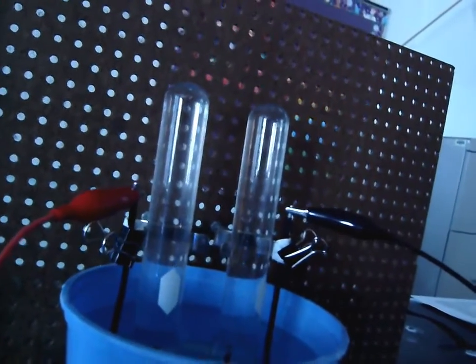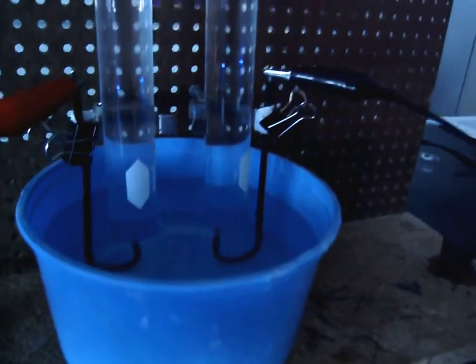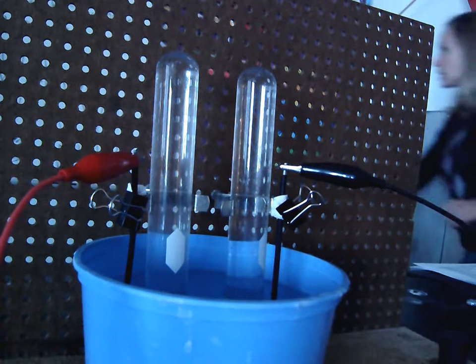Then we have these two things called electrodes. They're like little black J hooks, right? Let me show you what they look like when they're not attached to the setup, just so it makes some sense for you.